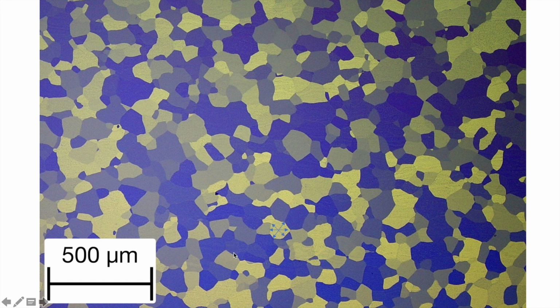The first assumption is having equiaxed grains. I can see from this microstructure, just by looking at it, I've taken a grain down here as one example. These grains are generally similar size in every direction. So I'm happy with our first assumption. There's another example up here which shows that. This grain's slightly different. Remember I was talking about how you're never going to get perfection. This grain is slightly longer in this direction than this direction. So it's not perfect, but it's good enough. I'm happy that we have equiaxed grains, generally similar in every direction.